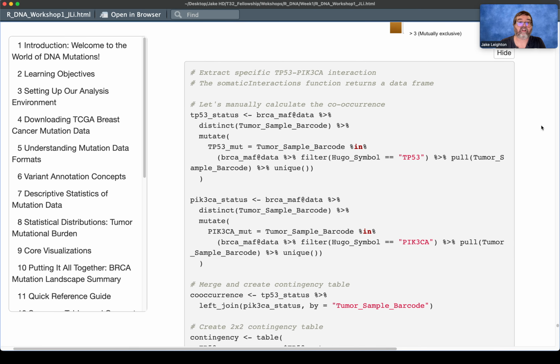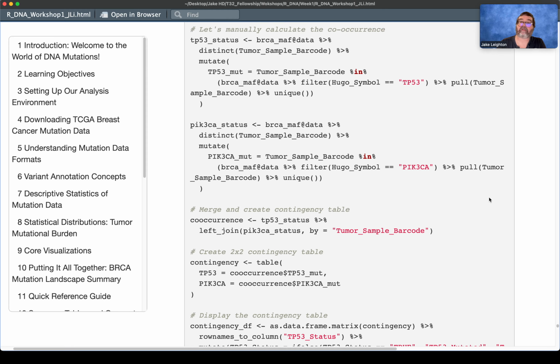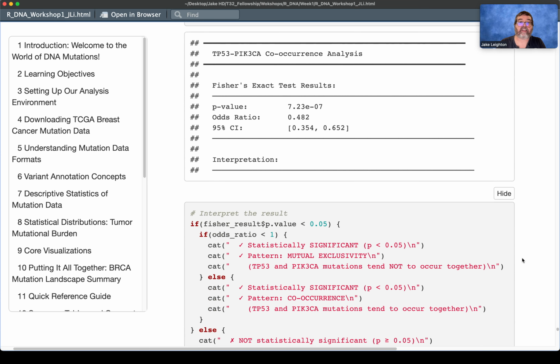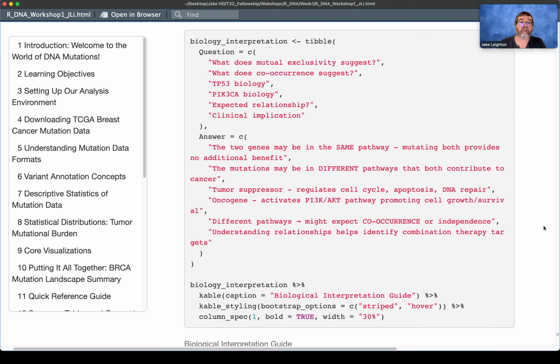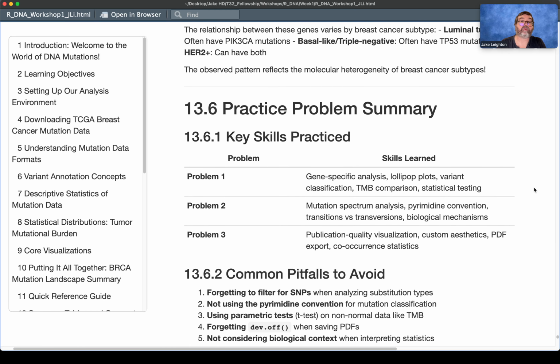I'm just reorganizing and data cleaning. When there's something like this, I'm just data cleaning and organizing. And I know that looks hard, but it's something you'll get better at, and AI can also help you with. And I just want to do a really quick check to see if that actually is significant. And once again, I look between those two, and it's extremely significant. So that's really good. And it's what we'd expected. And this is just looking at some of the co-occurrences between those different things. And I'll let you guys look more into the biology interpretation if you would like.